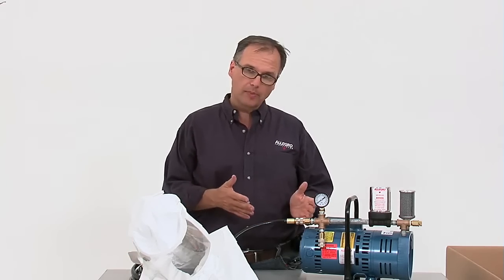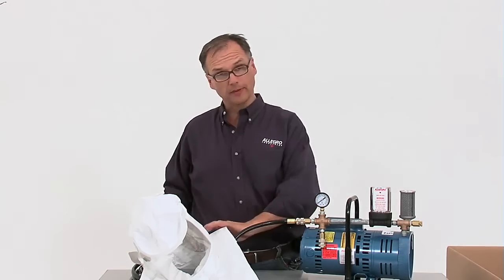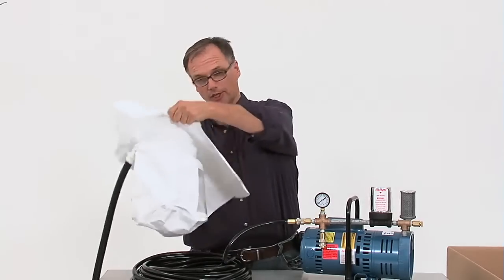Put the respirator on, turn on the pump, and you are ready to enter the work environment.